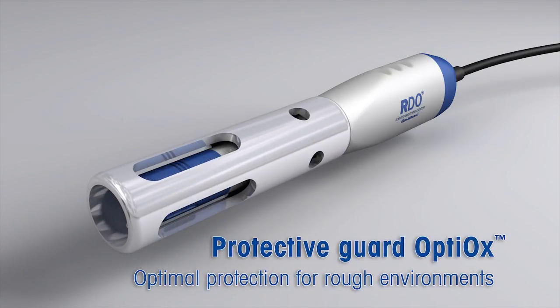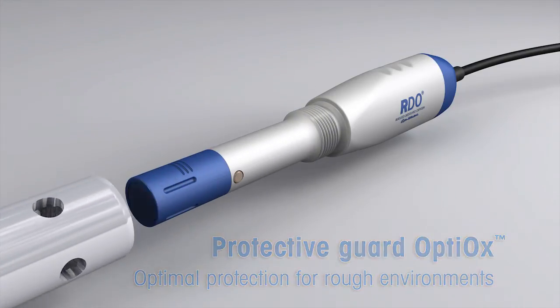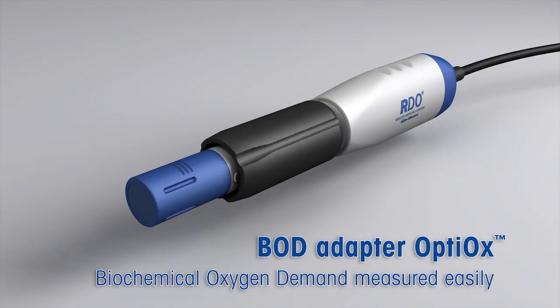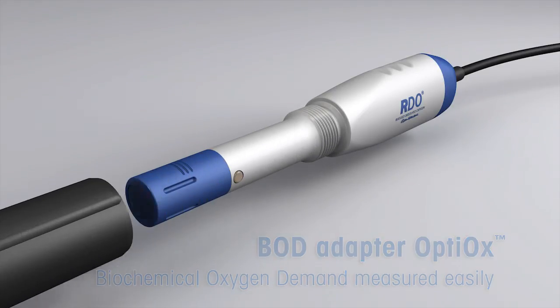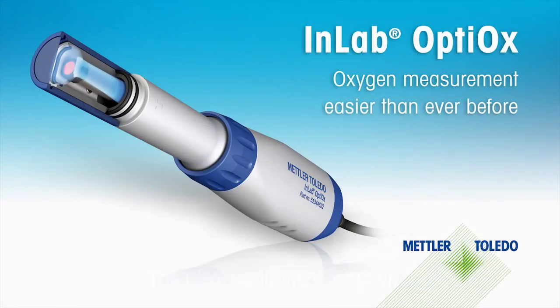Attach the robust stainless steel protective guard to reach deeper measurement locations. Or screw on the BOD adapter for quick and easy biochemical oxygen demand measurement of any effluent in all current types of BOD bottles. Oxygen measurement easier than ever before. Check out Optiox at mt.com/Optiox.